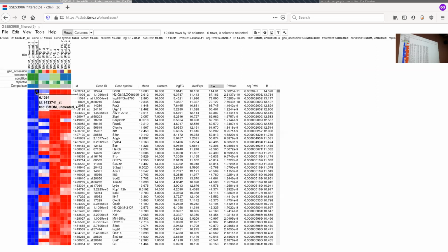Basically, it's actually called a moderated t-test, and the statistic that is calculated is a moderated t-statistic. Well, moderated is basically some kind of magic, how it's moderated. But in the end, there is a t-statistic, which is distributed with a Student distribution. Yeah, so the t here is the t-statistic, the moderated t-statistic.